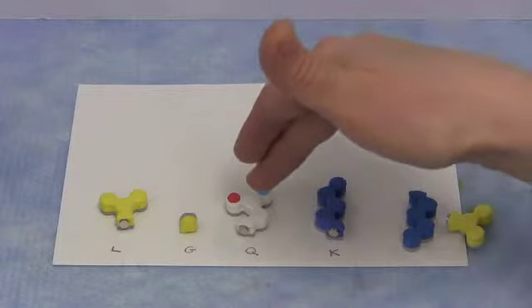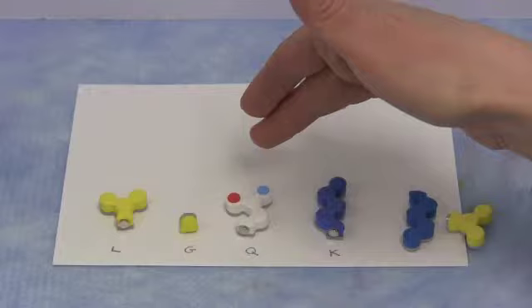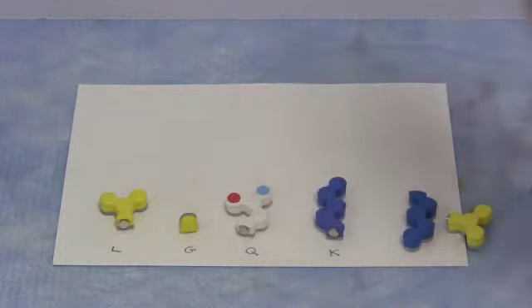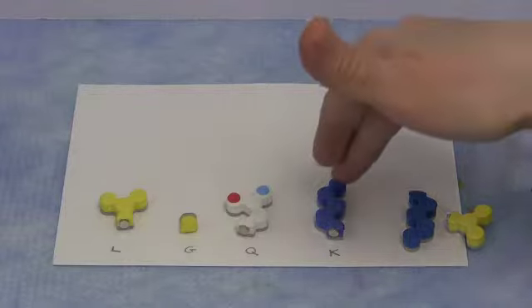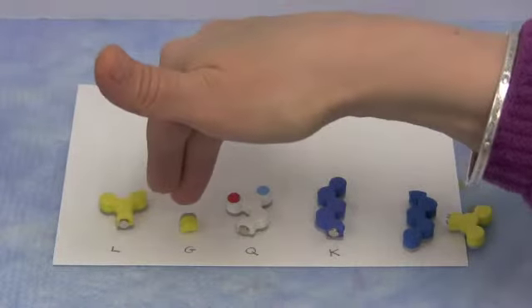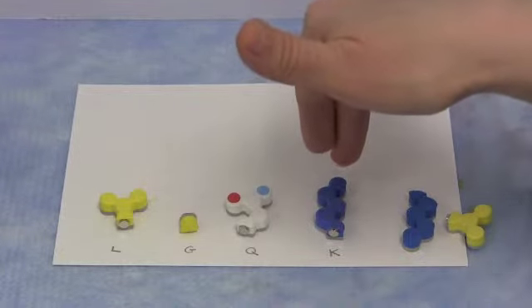This is uncharged, but it is polar, so it doesn't have a net charge like an acidic or a basic amino acid, but it is relatively polar. And then we have lysine, a basic amino acid, which at this pH will be positively charged. So this is very polar. So what we have here is very non-polar, sort of non-polar, sort of polar, very polar.